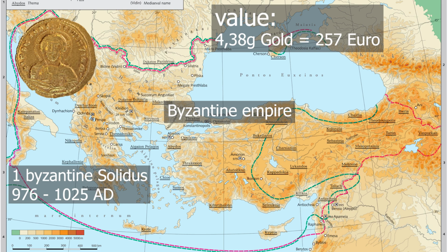And to summarize, XRF is a highly suitable method for analyzing thicker objects such as coins, but only if it's done correctly by addressing issues like inhomogeneity with multiple measurements and incorporation of correction factors.